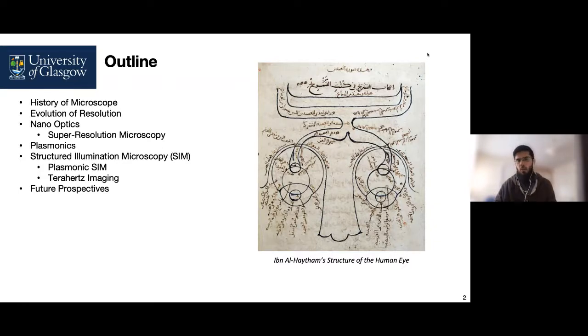And in nano-optics in particular, we would like to talk about a field called super resolution microscopy. And then further over there, we would like to talk about a particular type of microscopy technique which has been gaining a lot of interest in the past few years, owing to its ease of use, fast speed, as well as ultra high resolution capabilities.